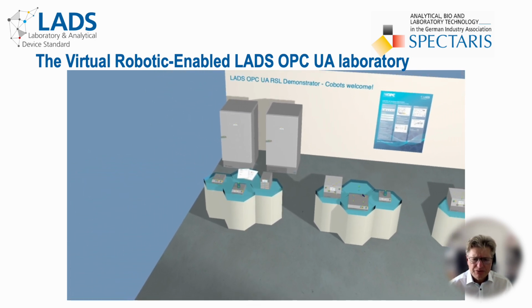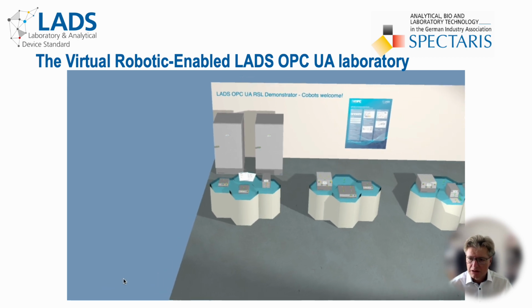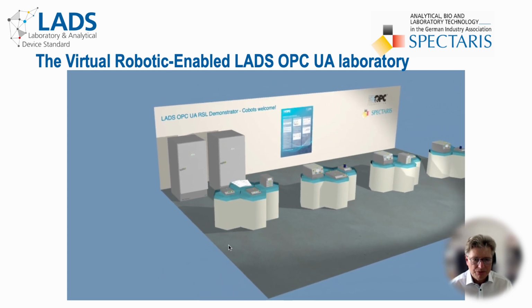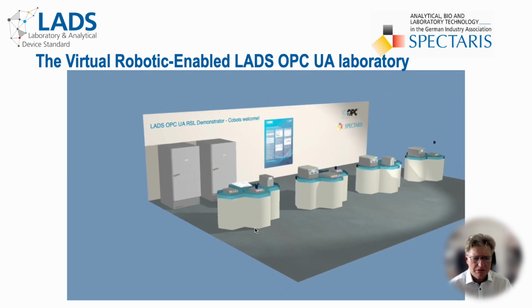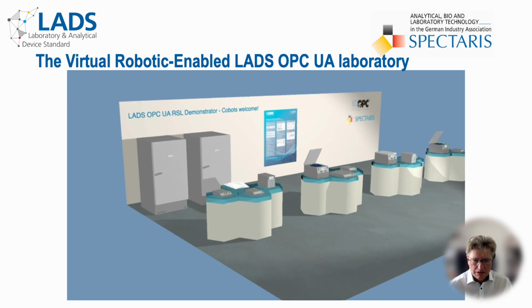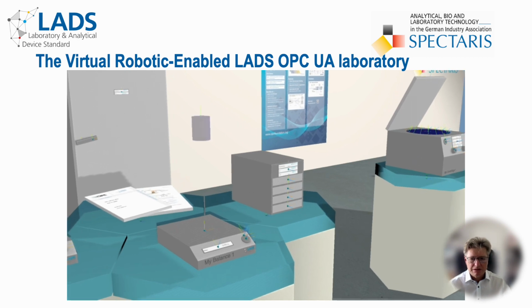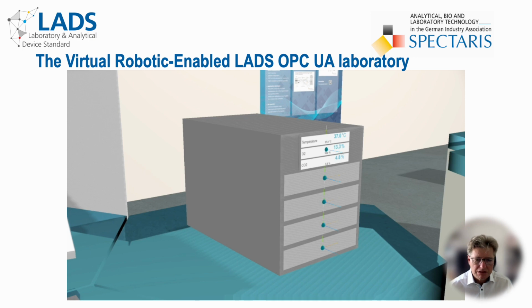An assortment of different lab instruments like mixers, centrifuges, work table incubators, plus 2 freezers at the wall in the back. Obviously, the instruments are operated by some invisible ghosts, maybe robots. All of them running, all of them exposing their actual status, including set points and process values, via OPC UA. This information can be viewed on the instrument displays. Within the next minutes, we will focus on the work table incubator.